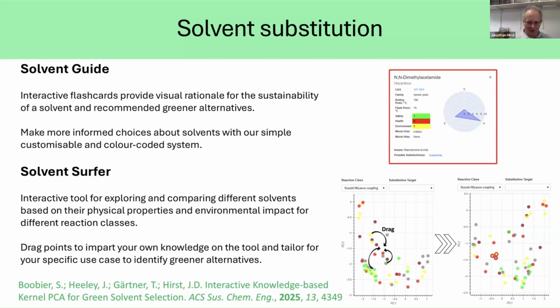Of course, AI and PCA aren't necessarily magic oracles of truth, so it might be your visualization in 2 dimensions doesn't reflect what you actually know about some of the similarities between solvents.